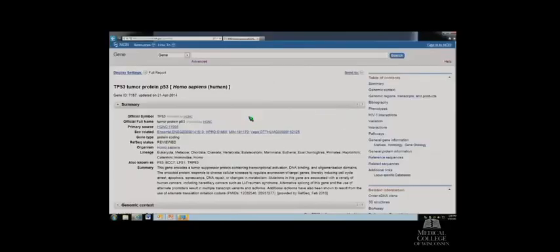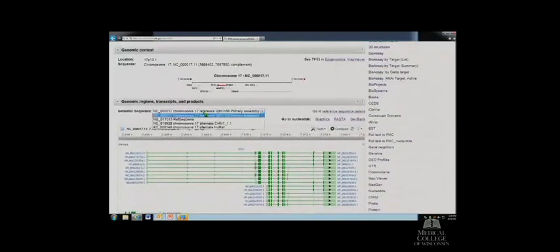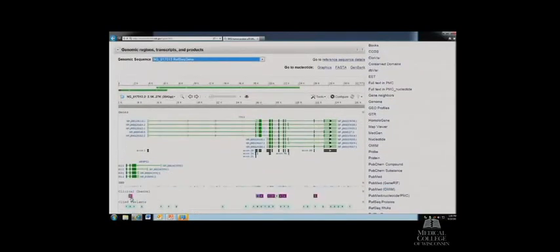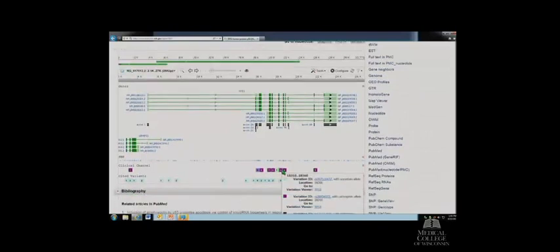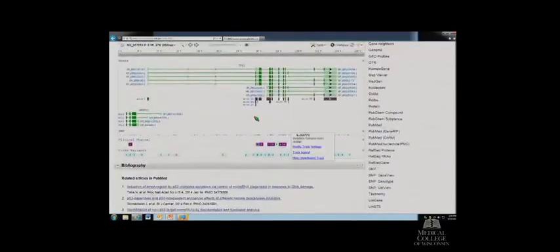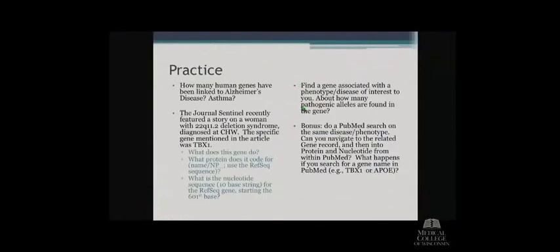But in terms of the pathogenic alleles, where I would find that is actually on that reference viewer. Again, going to the reference gene so that I can see that clinical channel. So on this particular gene for Li-Fraumeni syndrome, there's 1, 4, 6, 13, 18, and these have a lot. So you just add those up and recognize that there's over 20, probably over 30 different allele places that are pathogenic. And then the PubMed search.